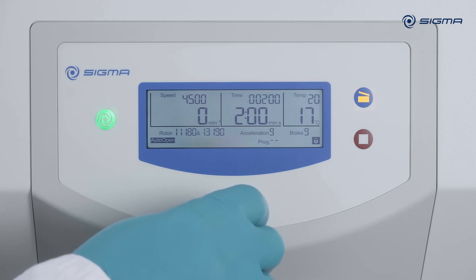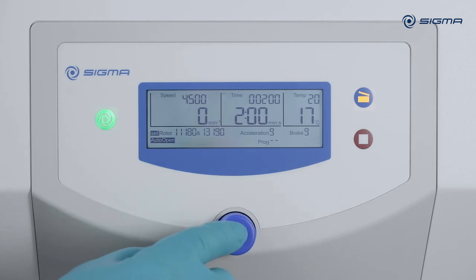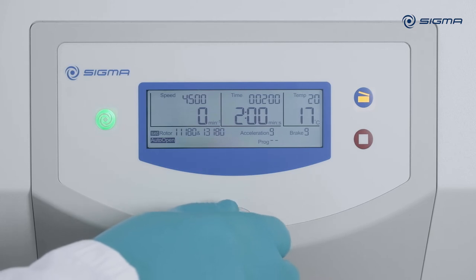To manually select a rotor or a rotor bucket combination, turn the knob six clicks to the right. After pressing the knob, you can select different rotors or rotor bucket combinations.